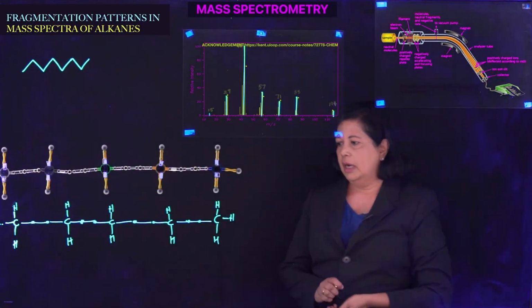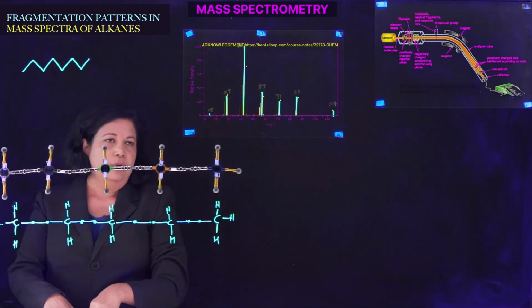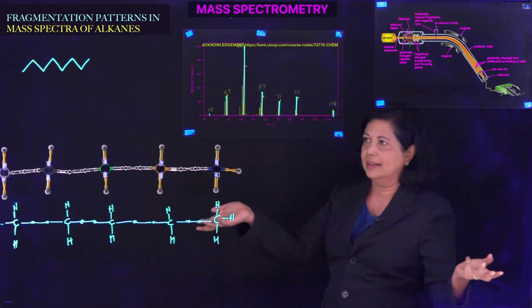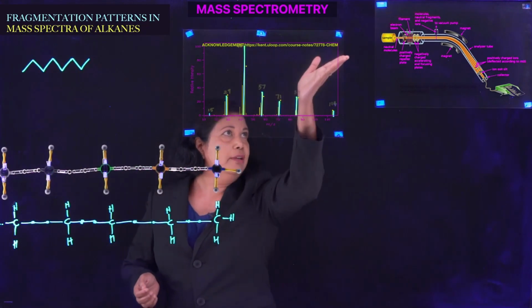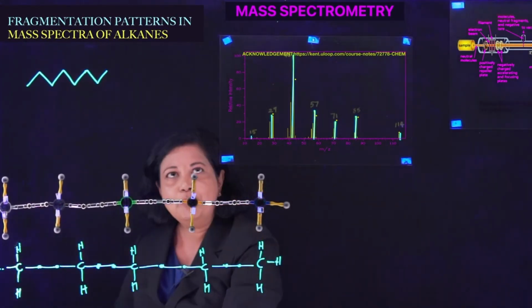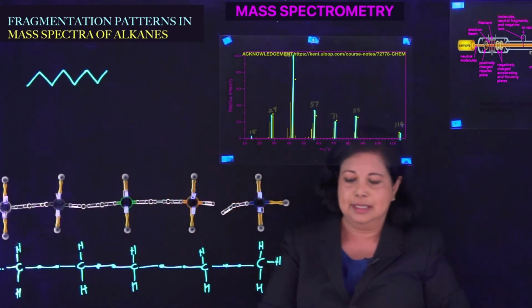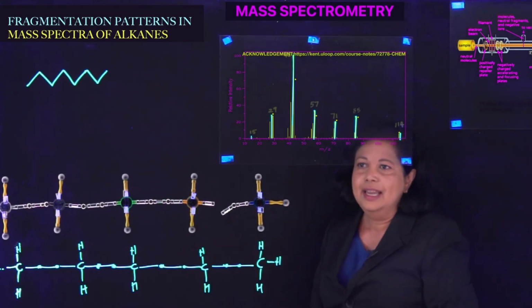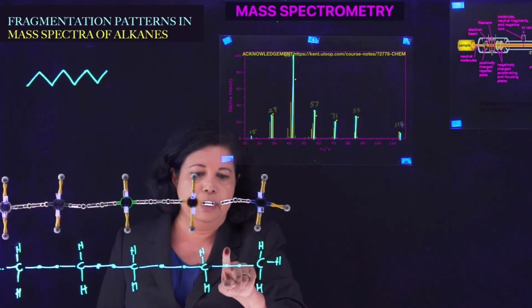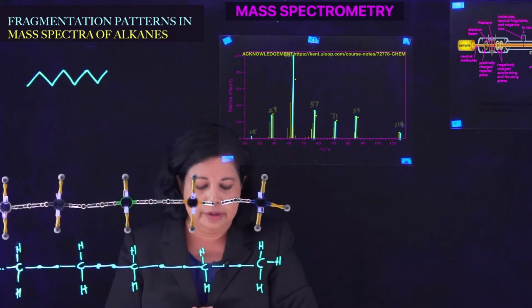And here you go, the molecule, octane's having a really nice day, probably had a nice English breakfast with a pancake and a stack of bacon, and driving along the freeway here, and bam, it gets hit by this 70 electron volt lightning, okay? And one of the electrons is gone. It's leaving a hole here. So basically it took off the electron. Oh, well, can you even hold it together?